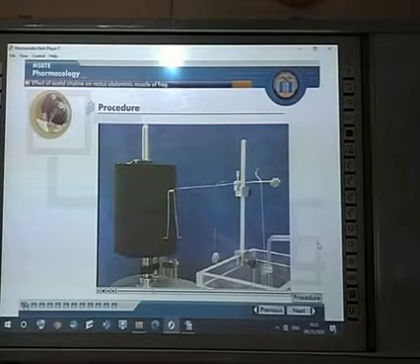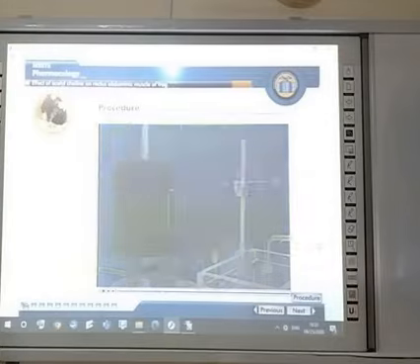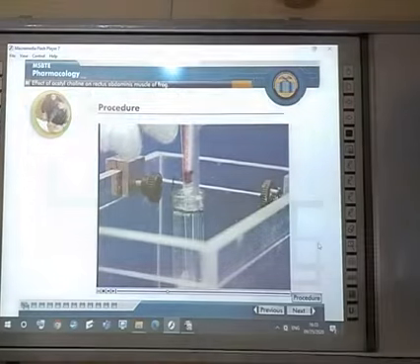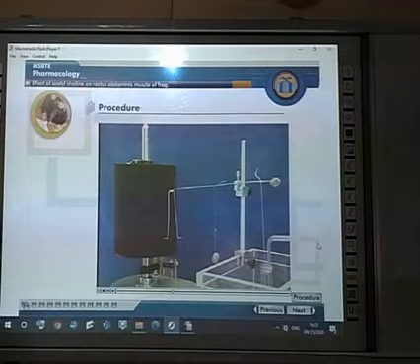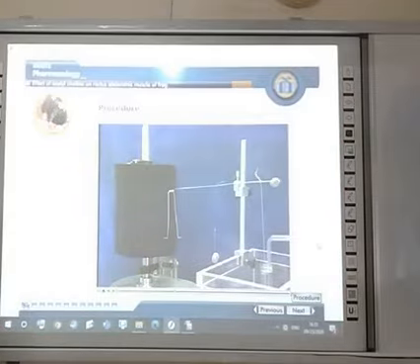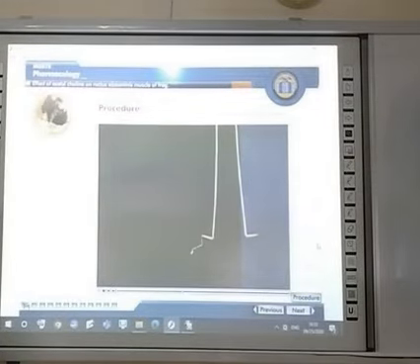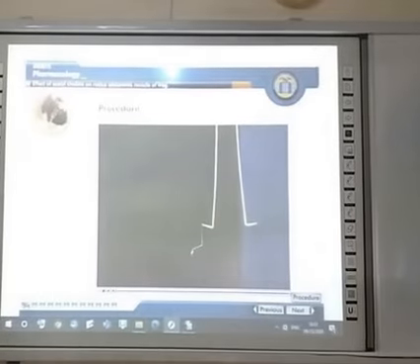Start the trial after stabilization. Take a baseline for about 30 seconds on smoked paper. Now stop the trial and inject 0.1 ml of acetylcholine solution in the reservoir containing the mounted muscle preparation. Start the trial immediately. Record the contractions for 90 seconds.